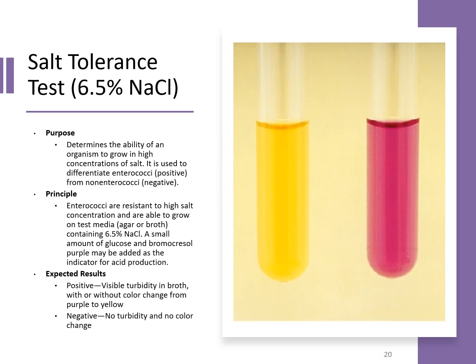Your salt tolerance test, or your 6.5% sodium chloride. If you have an organism that is resistant to a high salt concentration, so an example of this would be your Enterococcus, then if you're suspecting that, you could inoculate a broth media with that colony, and then you allow time for that organism to grow.